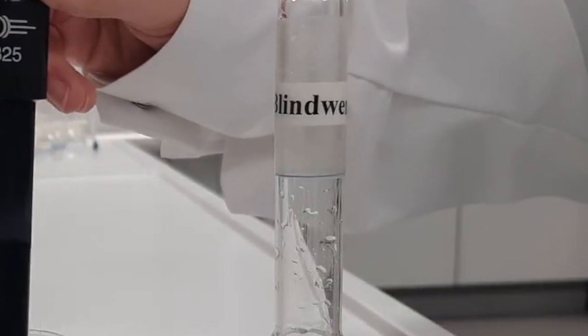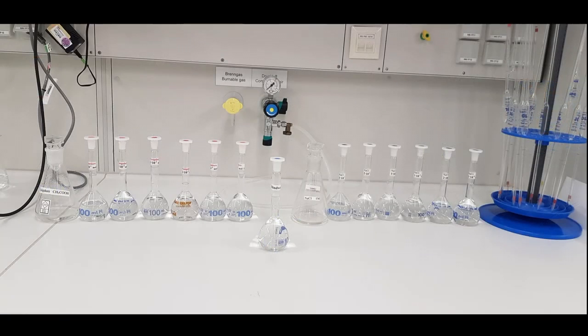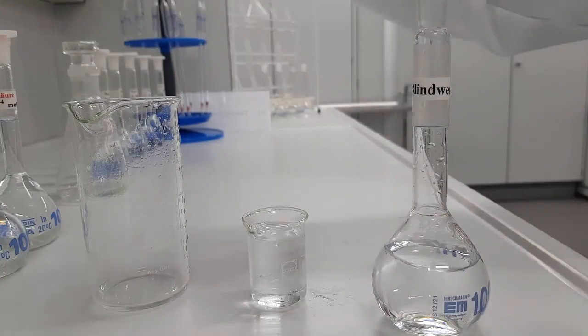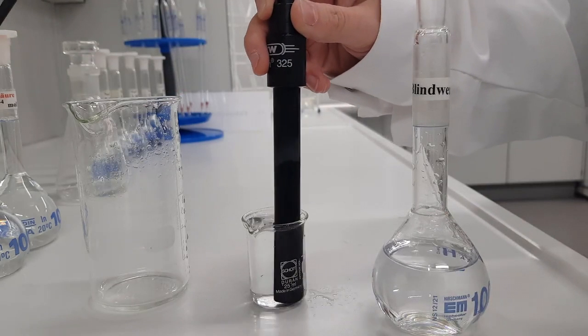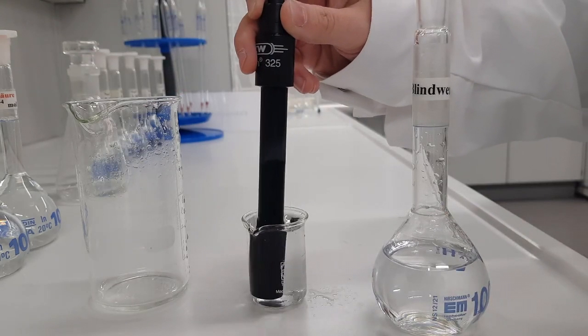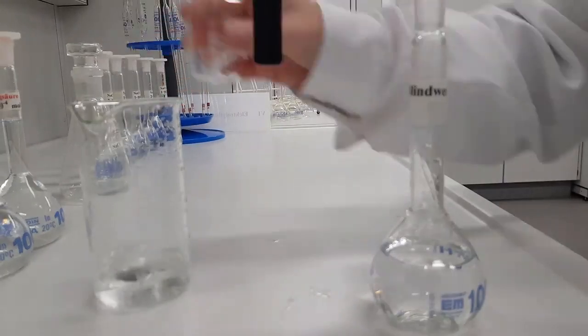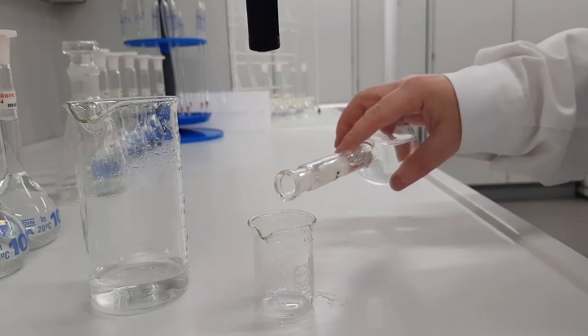When doing the measurement with a conductometer, its electrode first has to be rinsed with the sample to be measured. Fill the solution to be measured into a small beaker, immerse the electrode into the solution, give it a brief stir and discard the sample. Fill up the beaker again and now do the actual measurement.